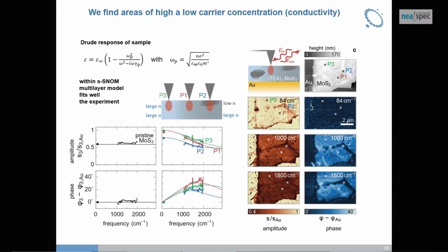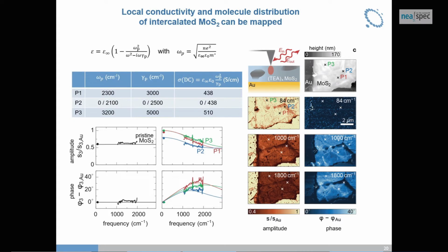For example, in these black areas, we obviously have undoped areas. And that's probably the reason why superconductivity in this material was achieved only partially. But that's ongoing research, so it's all a little bit speculative at this moment. From that, we can then extract carrier frequencies or carrier concentrations, and we see that it varies in the doped areas about 50%.